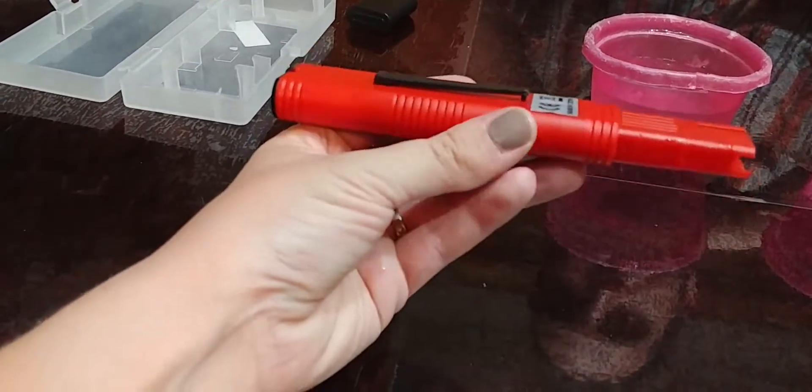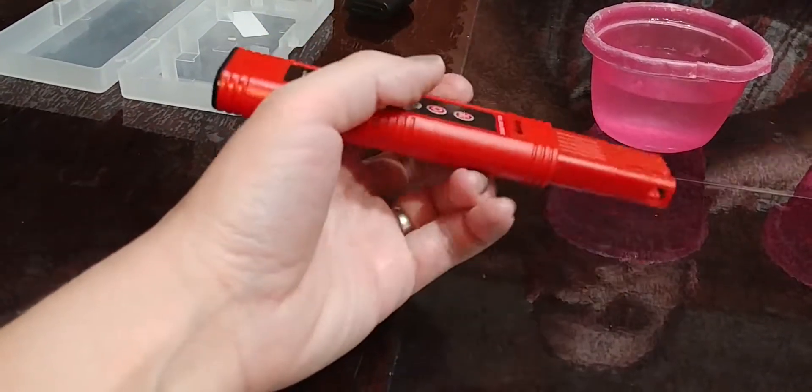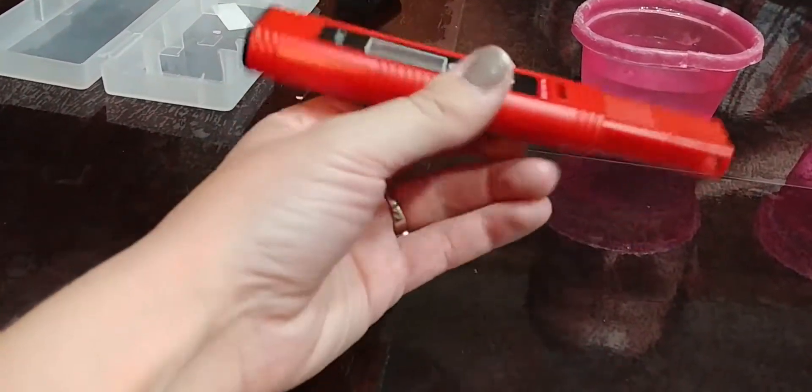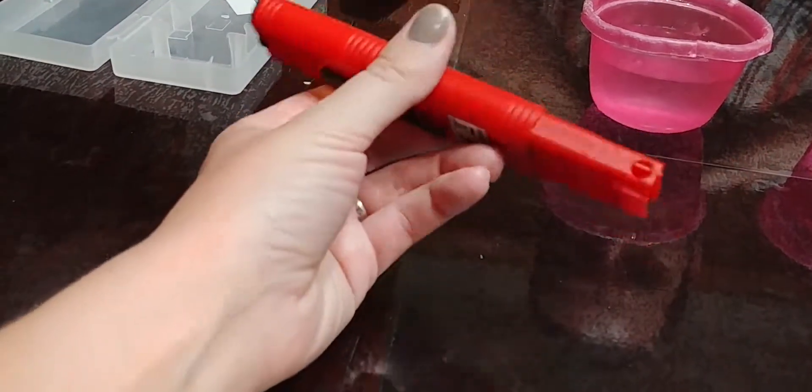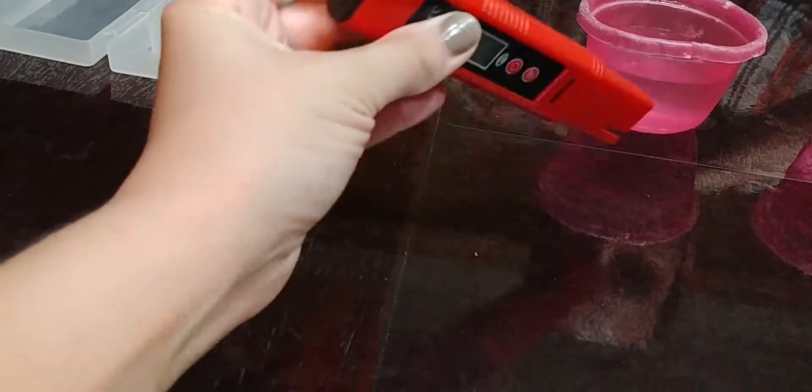It's really small and lightweight. It also has a little clip on the back so if you're wandering around testing your pool and adjusting the levels, you just clip it onto your belt loop or something while you're doing that and continue to check it. Convenient little tool.